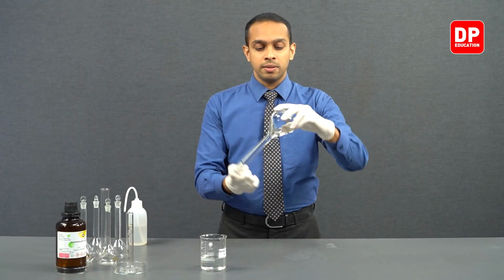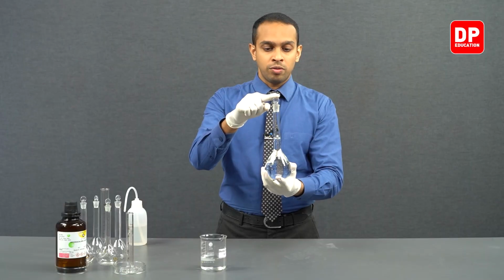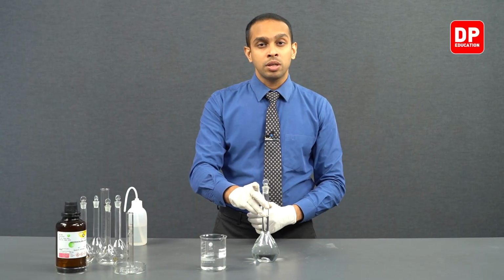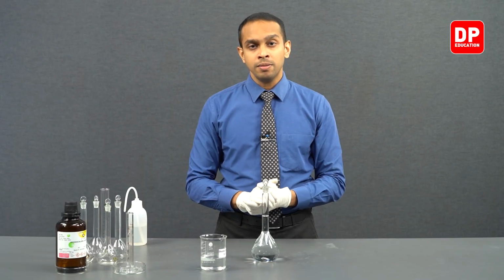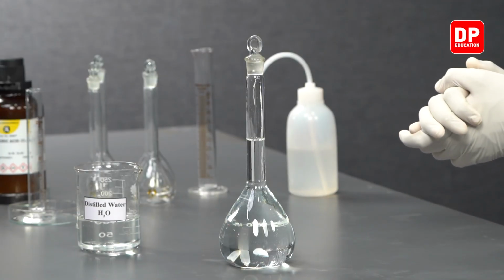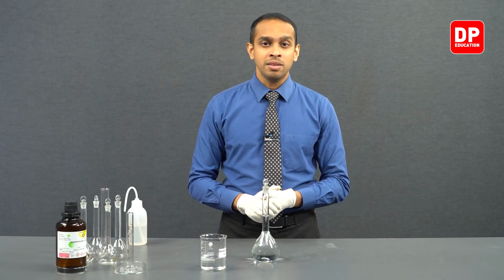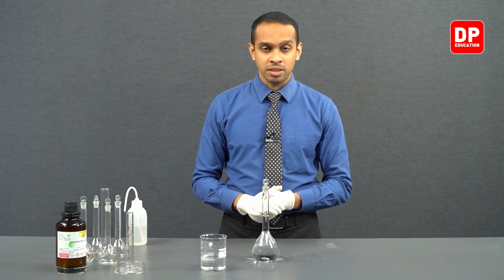We can turn it upside down a few times so that we mix the solution really well and produce a homogeneous solution of HCl, and the concentration of this HCl is going to be 1 mole per decimeter cubed. Now let's move on to making HCl solutions of different concentrations.